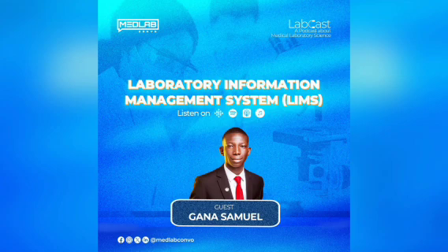Number two, people don't want to upgrade. What do I mean? Now, one thing that comes with using LIMS is that you have to be computer literate. At least you should know how to type, you should know how to use a computer. Most people are not willing to learn that. This is in simplest form.